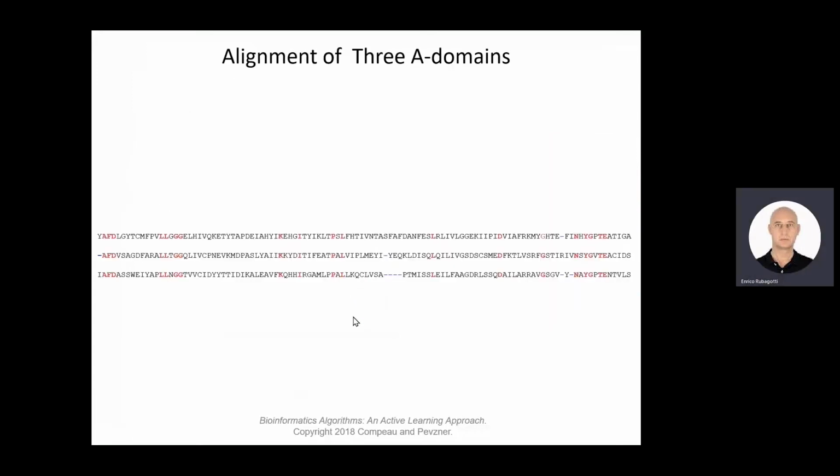This is the previous 3A domains, and it would be nice to have a multiple sequence alignment of these 3 domains.